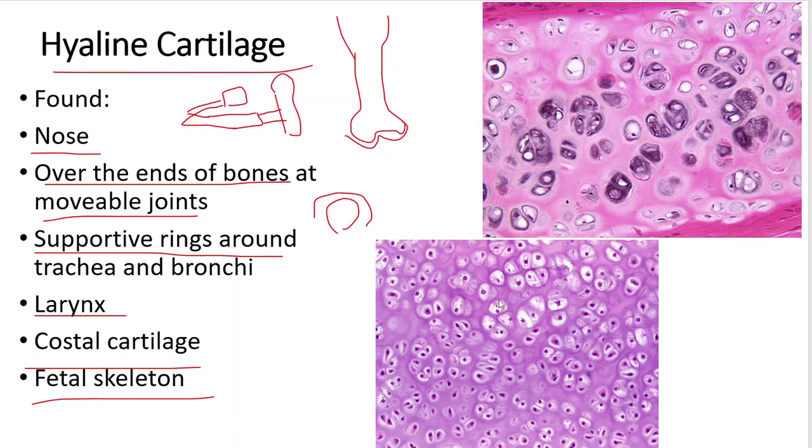Okay, now how am I going to tell this? Well, there are fibers in that cell matrix. That's in that ground substance, but you don't see them. They're not prominent. So a lot of times they will have these guys on a white background because of the stain they use. And in those instances, I always remember these as eyes in a snowbank.